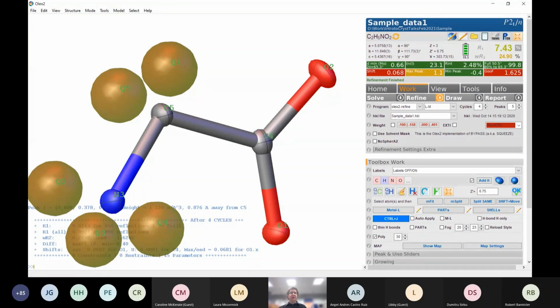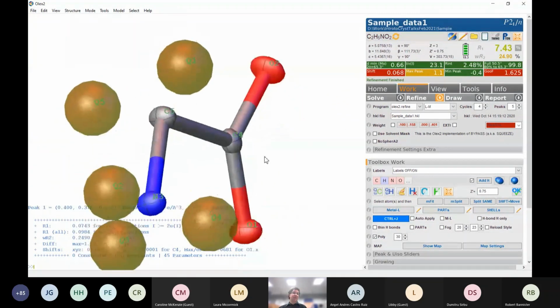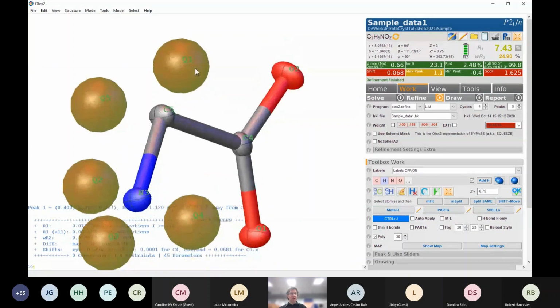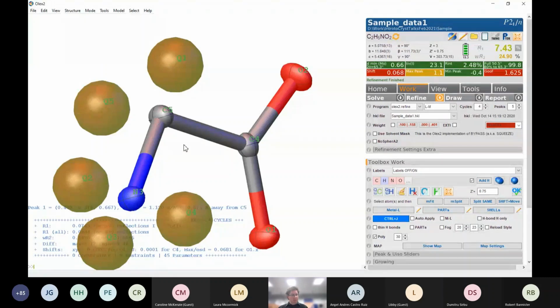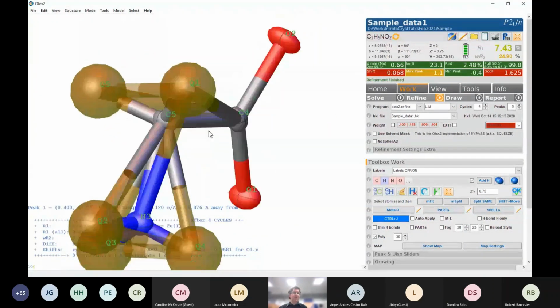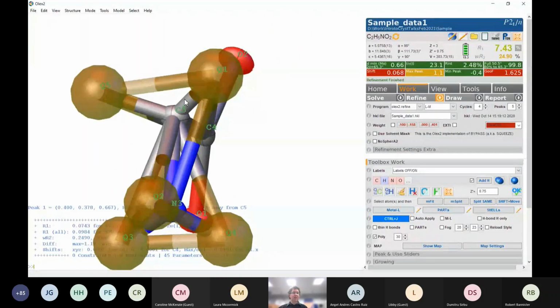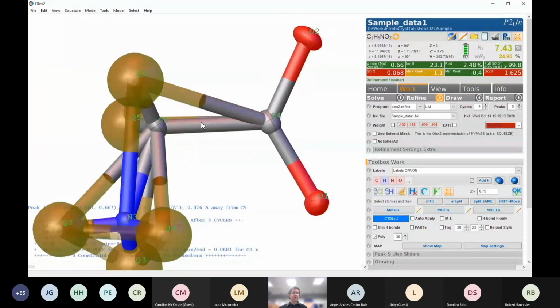As I say, the maximum peak, we're down to a stage where the only peaks left are around 1, which, if you think about it, is what you're looking for with hydrogens, each of which has 1 electron. They're involved in bonding and everything else. On this structure you've got Q1 to Q5, and there are some bonds here that look like 3 around the nitrogen and 2 to the carbon, which is what we expect for glycine.